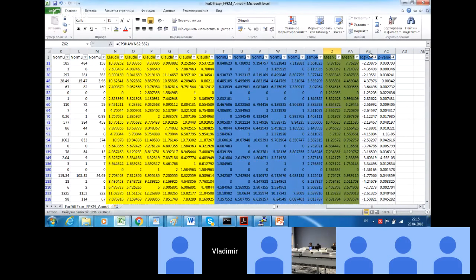The primary reason for having such a great number of genes here is that we simply dealt with unadjusted p-values, which really increased the number of genes. However, the statistics we used here are not the most powerful ones.